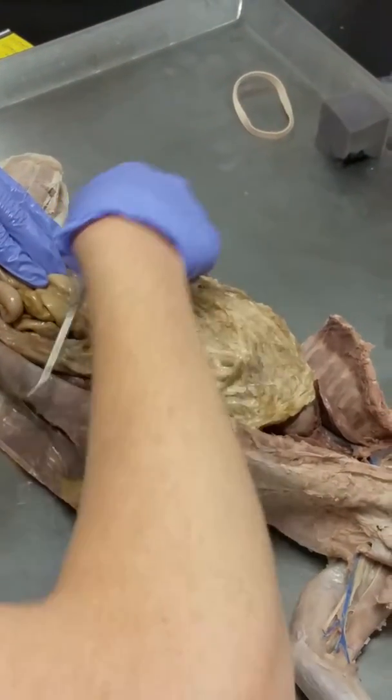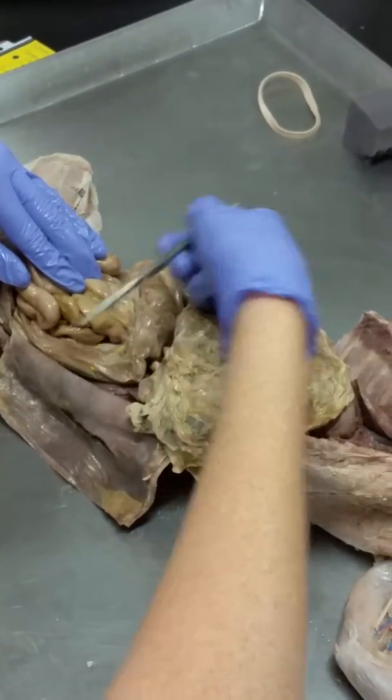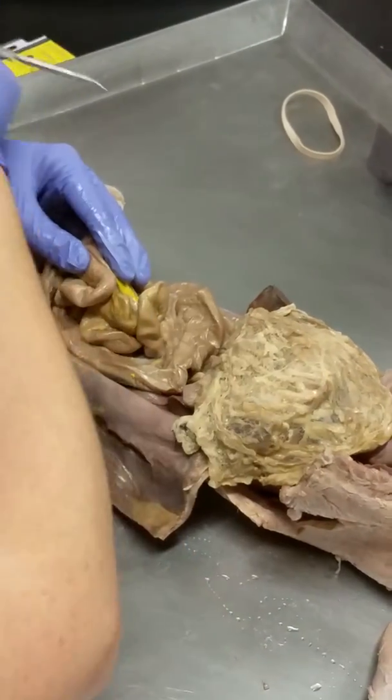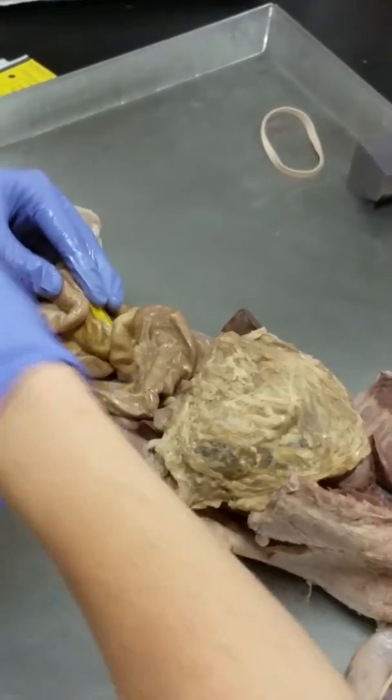The part that goes up, that's ascending colon. The part that goes across, that's transverse colon, because it's in the transverse plane. And then the part that goes down is the descending colon. So it goes ascending colon, transverse colon, descending colon. It's real simple.